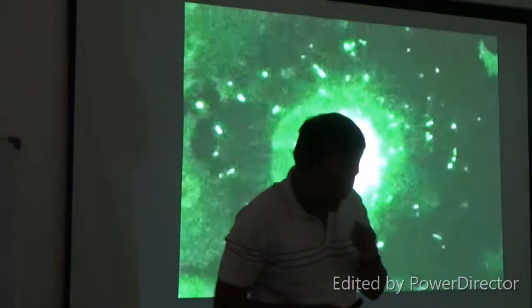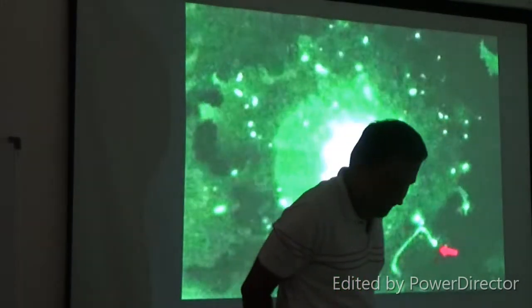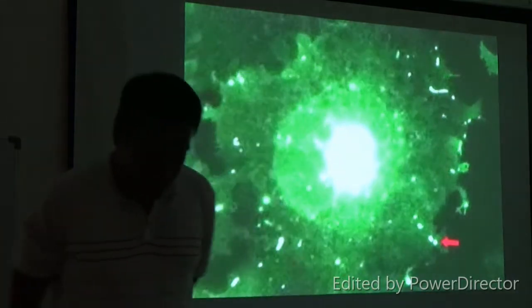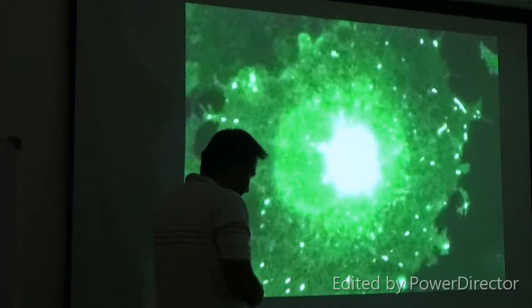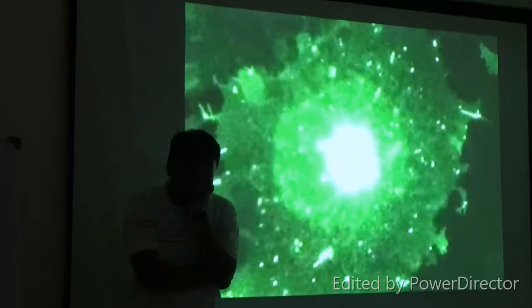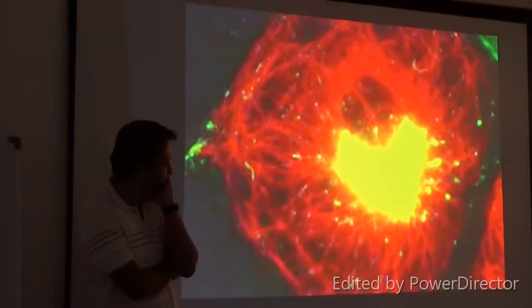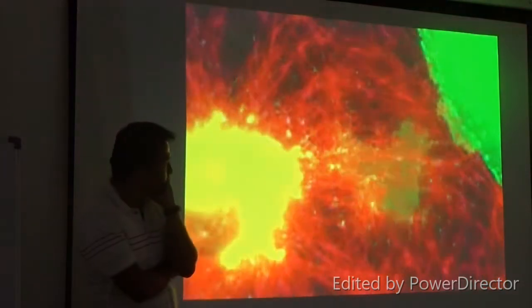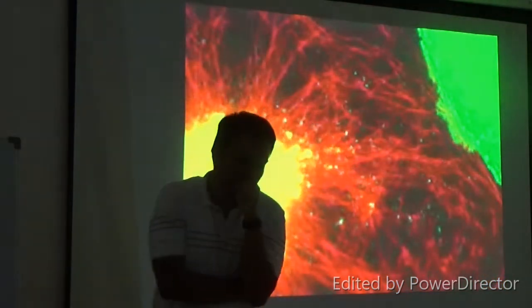Apparatus on way to the cell surface are often packaged into tubular transport vesicles of significant size. Such tubular vesicles can branch and fragment before they fuse with the plasma membrane. The transport vesicles move along microtubules, which are stained here with a red fluorescent dye. The green cell in the corner does not contain fluorescent microtubules.